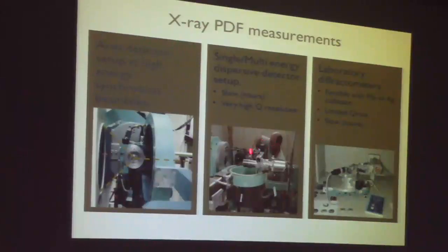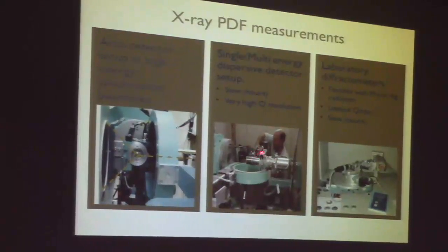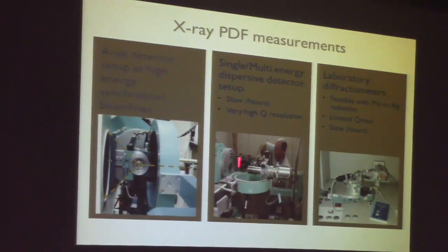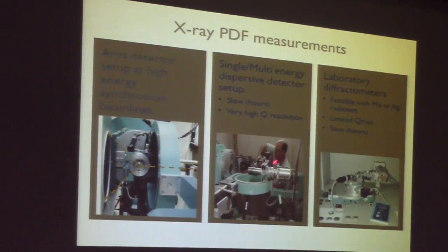And what Stefan is doing is he's working on the detector, which was a germanium point detector. What happens is that you collect a data set in here by actually rotating this. You can see this big wheel here. This wheel rotates and the detector goes in a circle around here. And so we collect the data one point at a time.